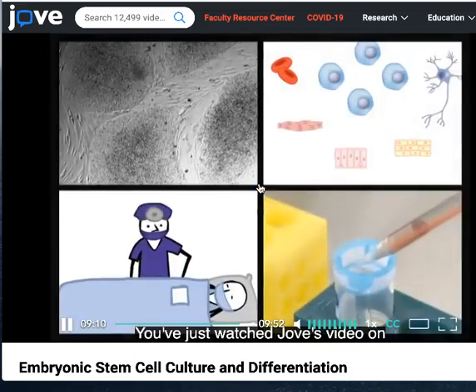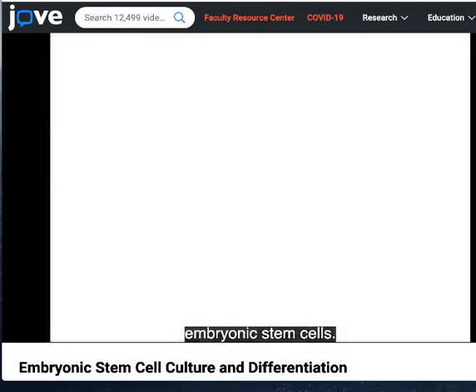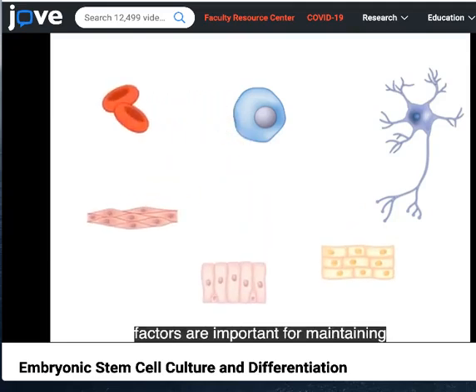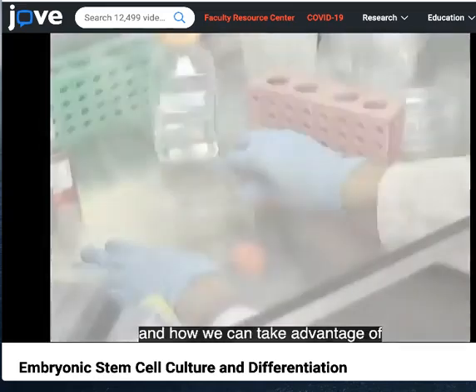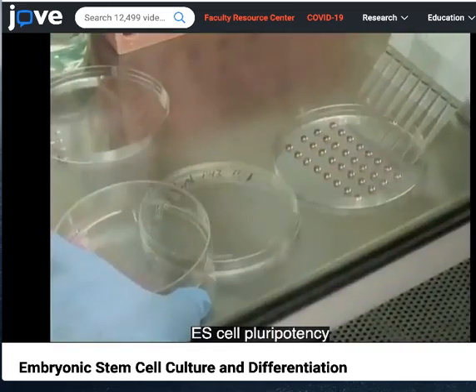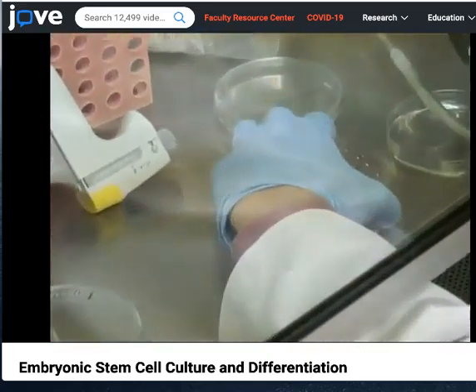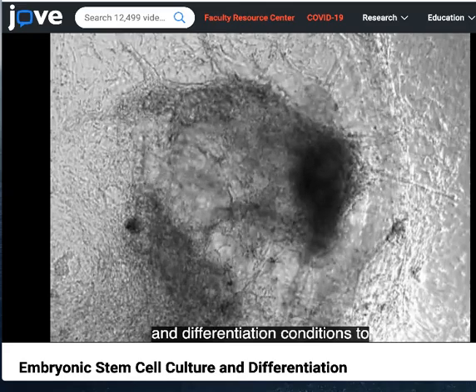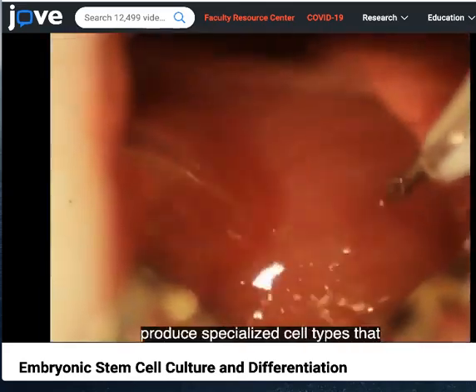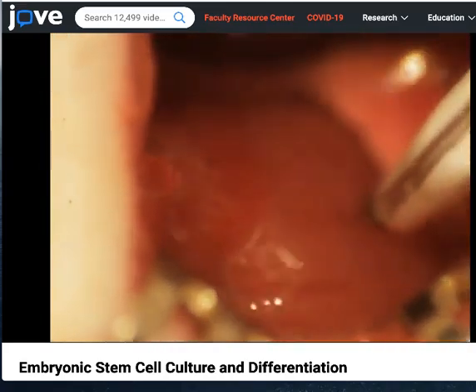You've just watched JoVE's video on how to culture and differentiate embryonic stem cells. You should now know what factors are important for maintaining ES cells in their undifferentiated state and how we can take advantage of ES cell pluripotency to generate specific cell types in a dish. Going forward, scientists will be working to develop more efficient and well-defined culturing and differentiation conditions to produce specialized cell types that can be used in regenerative medicine applications.